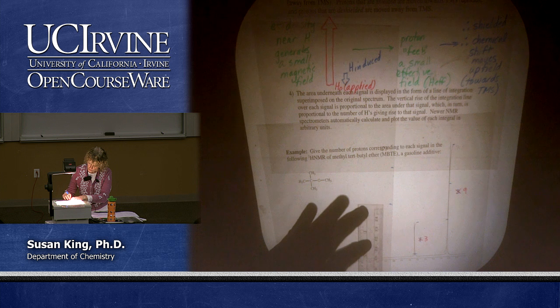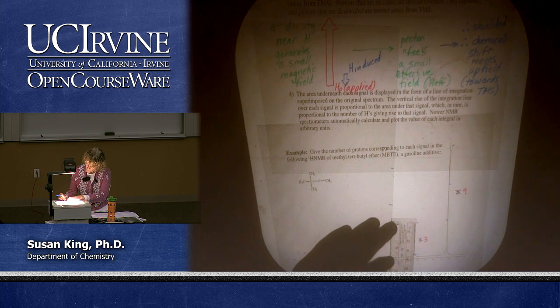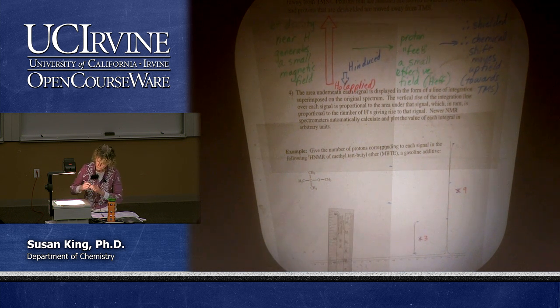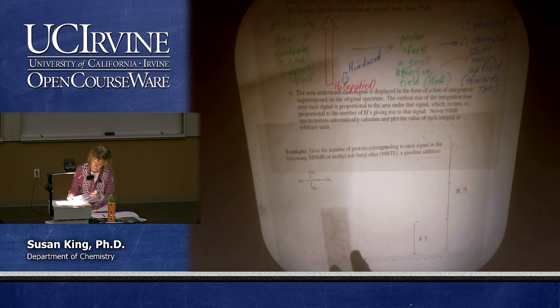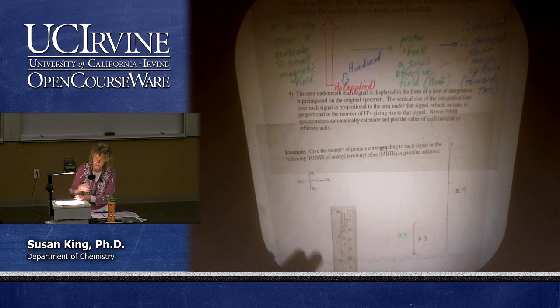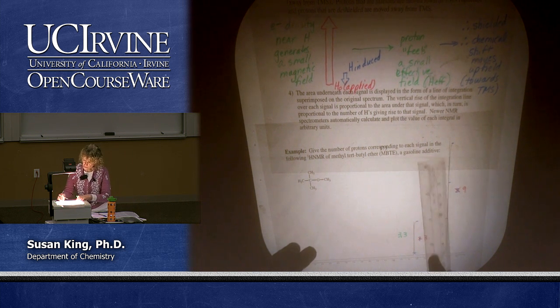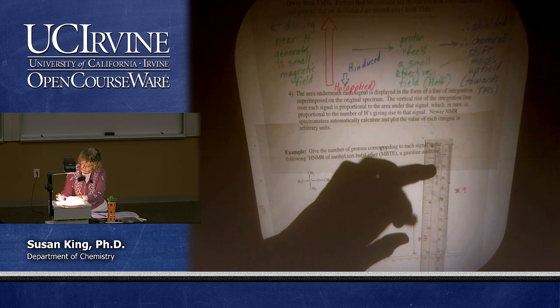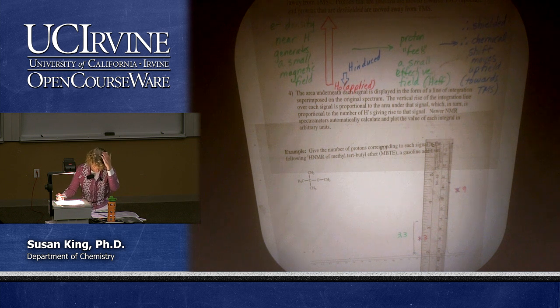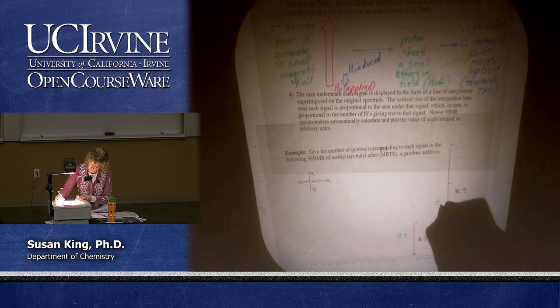So I take my ruler out, and I'm just going to say that's 3.3 centimeters. Take this piece of paper away. 3.3. The units do not matter. Just be consistent. That's 3.3. And then I measure this distance here. And what do I have? I have 10.3 here. So that's 3.3. This is 10.3.